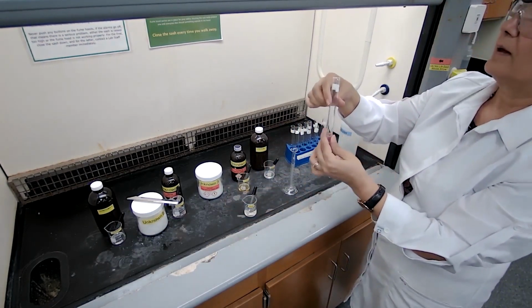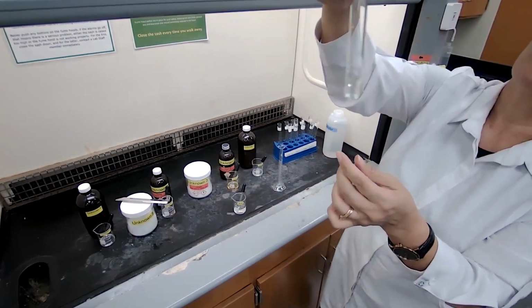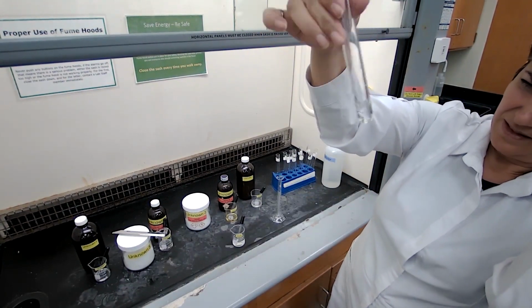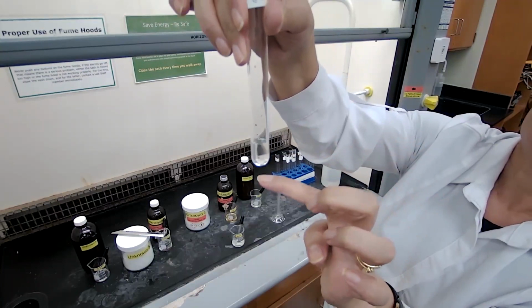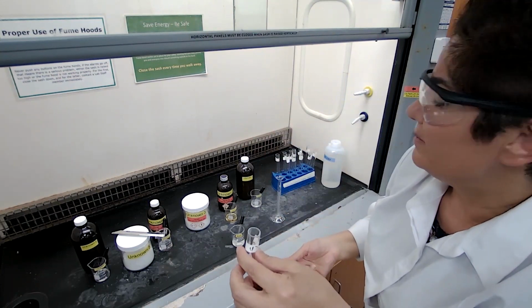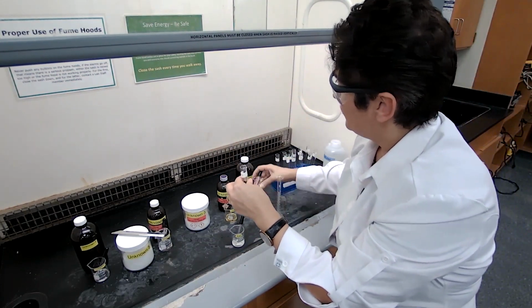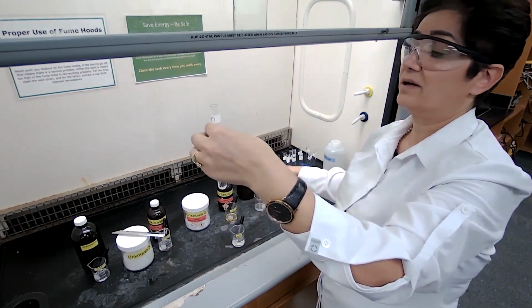Okay, going to start with unknown 1 in water. It might look like 1 layer, but when you mix it, you see droplets of oil coming down into the liquid and going up, and I can add more drops to make the layer thicker for you to see.